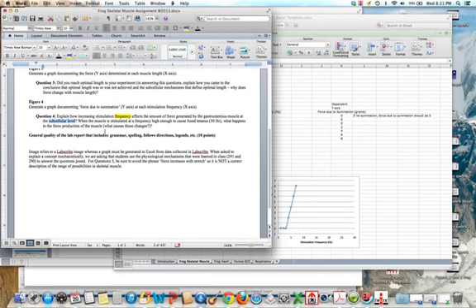And so then when it goes into what happens when the muscle is stimulated at a high enough frequency to cause fused tetanus, what happens to the force production? What causes it? In this case, we're thinking about what happens as you start to see the summation of two muscle tension twitches, and they come closer together. One hasn't had a chance to completely relax before the other one sets in.